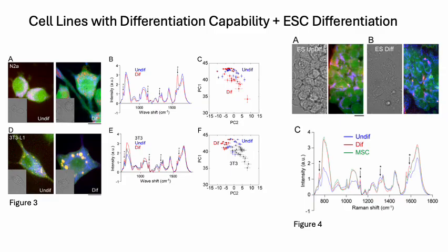On this slide, we're going to talk about different cell lines, but cell lines that haven't fully committed to a mature state yet. These include Neuro2A, which is a neuroblastoma line, and 3T3L1, which is a preadipocyte line. Before they are induced to differentiate, Neuro2A cells typically have a rounded, undifferentiated cell appearance, while 3T3L1 cells are small and resemble fibroblasts. Once differentiation is triggered, Neuro2A cells begin extending neurites, which are the branching structures typical of neurons. And this gives them clear neuronal characteristics.